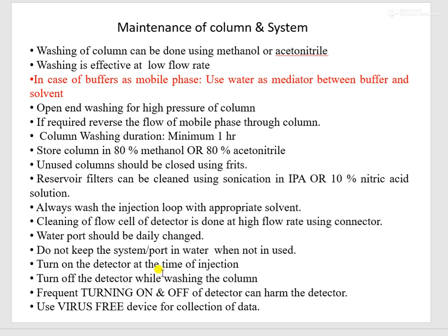Turn on the detector at the time of injection, means when you are sure that you are going to inject the sample, at that time only you should turn on the detector. Otherwise what will happen, unnecessarily the detector will remain on, and the shelf life of the detector will be reduced. So whenever you are sure that you are going to inject your sample, at that time you should turn on the detector to save the lifespan of your detector lamp.